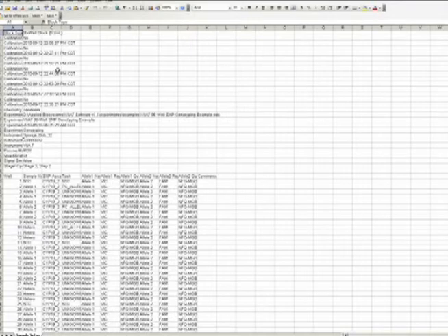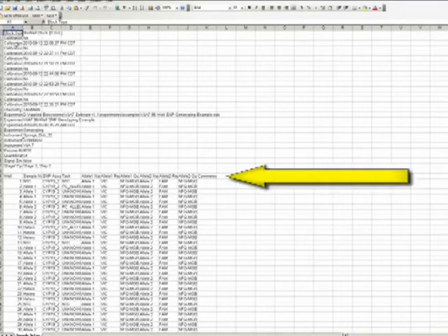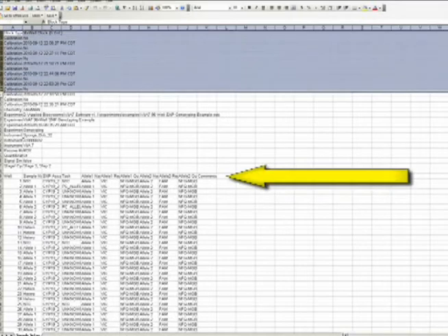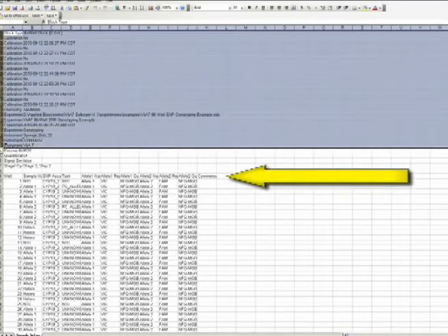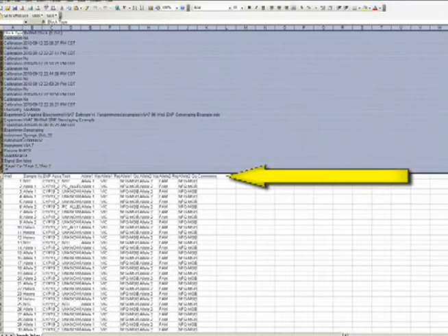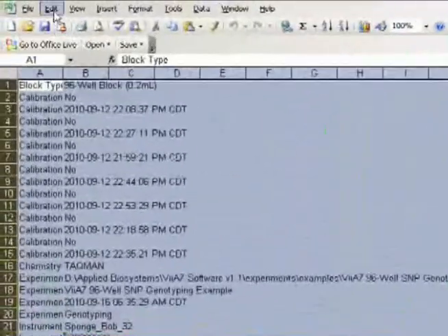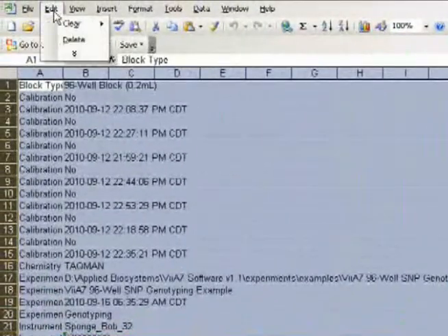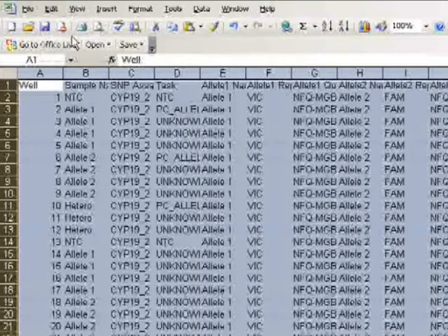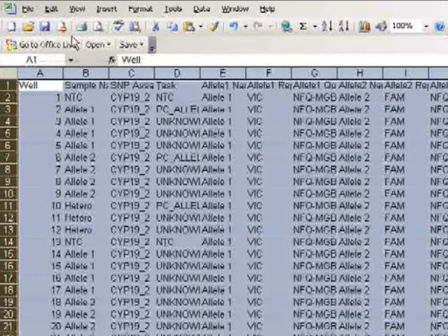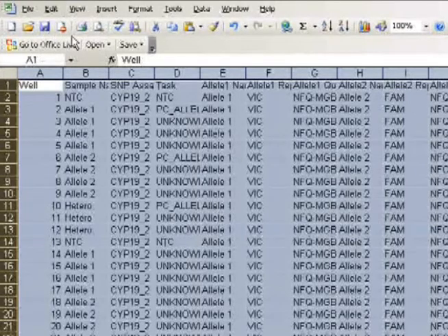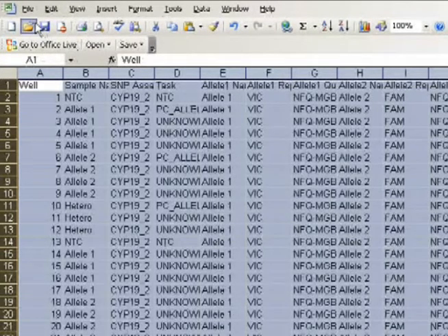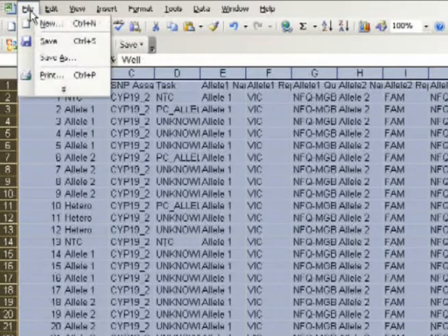We can't actually import this data into a new experiment file, since it's specific for the last run we did. So I'm going to select all rows above here by dragging my mouse across the row numbers, and then do an Edit, Delete. Perfect. One more thing. Before continuing, I'll save the file with this change made.